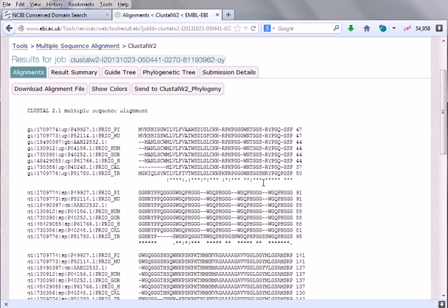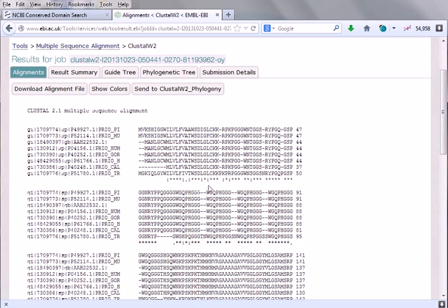Star means exact match. You can see S, S, S, everything is there. But this one means not exact match, but there are T's most of the case, but this one is consisting one S, so that's why it changes the structure from star to this one. It varies with this particular marking.